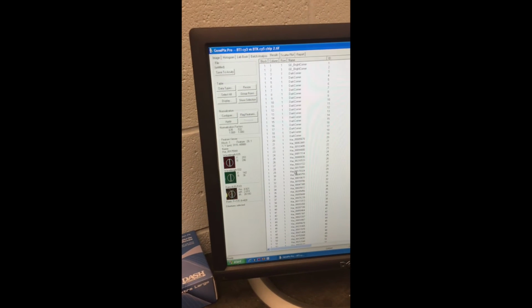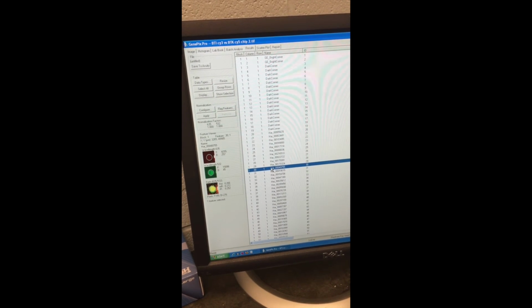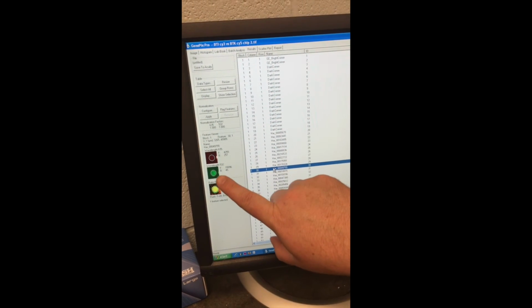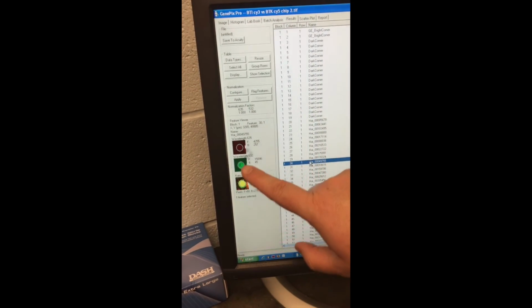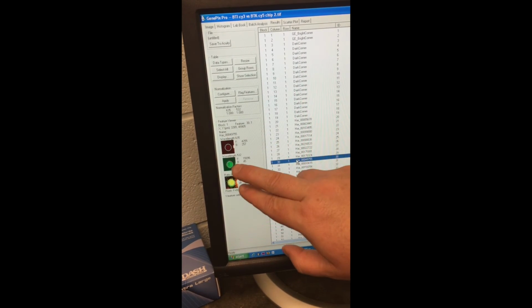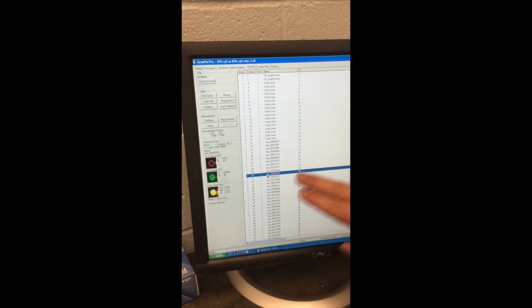Okay, so now over here it's showing you different gene names, and if there's flags. So look at this one here. This is going back to the original map, and it's showing you that this gene was turned on in the green treatment, but not in the red treatment, whatever that happens to be, whether it's a bacteria or whatever. Actually, they're both different types of bacteria, but this gene is being turned on. And then you can do statistics on it.